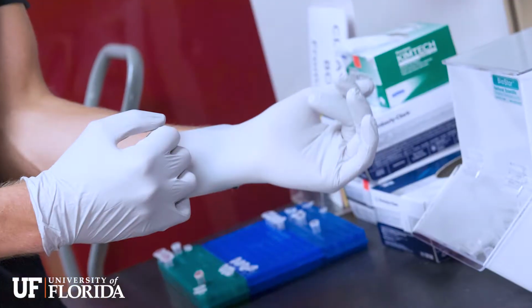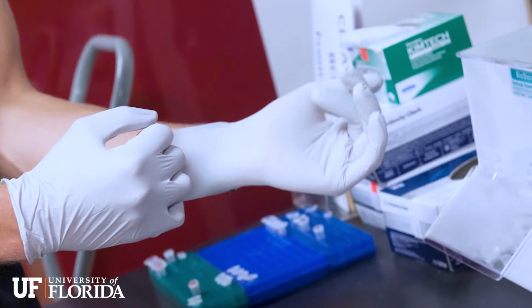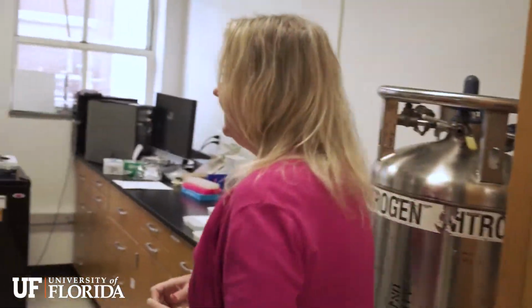This instrument is actually available for self-operation after training. So as a student, you can be trained on this instrument and you can run the samples by yourself.